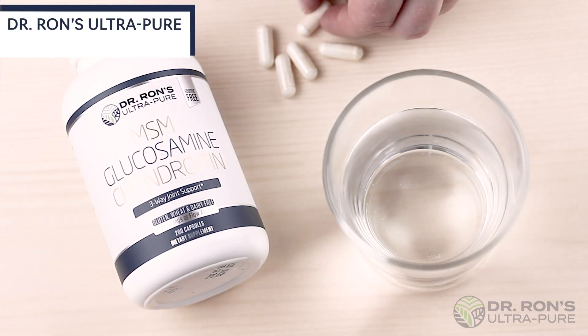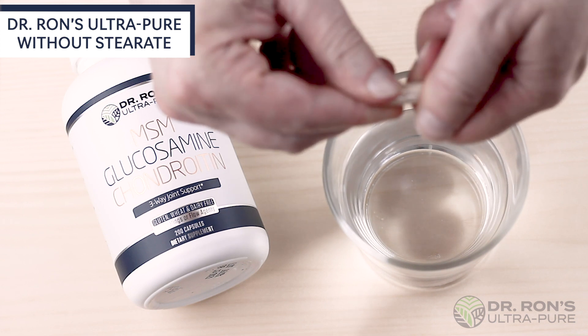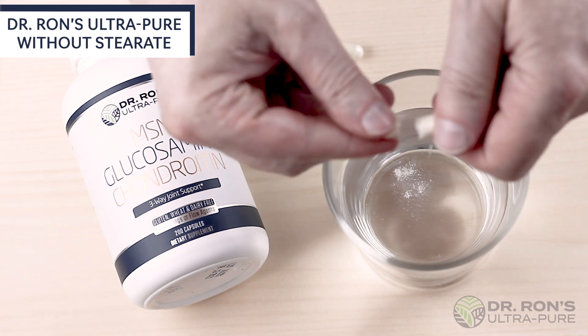Next, a similar formula without the stearate had little difficulty dissolving rapidly.